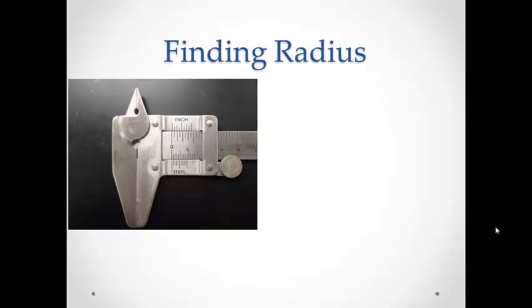To read our measurement, we need to make a note of where the zero mark is when the calipers are closed. Note that the first millimeter mark is zero.